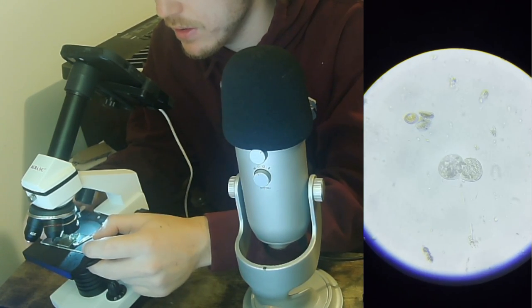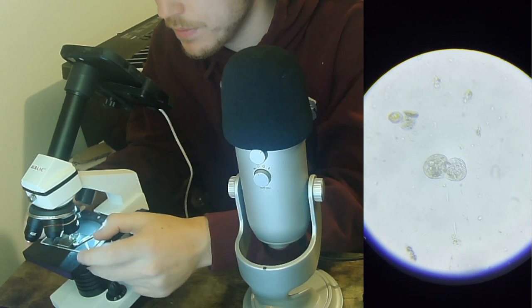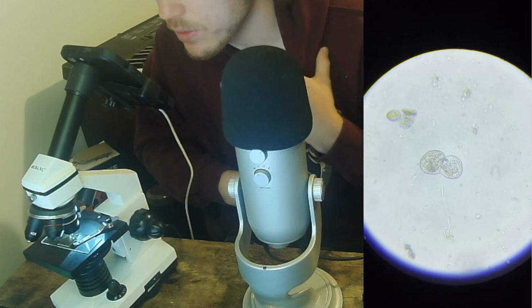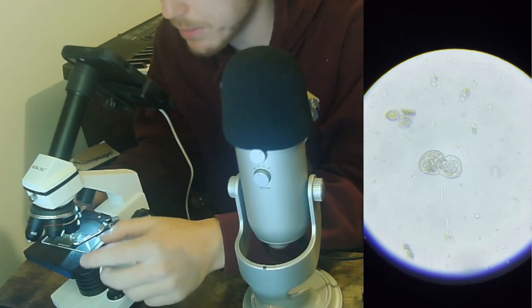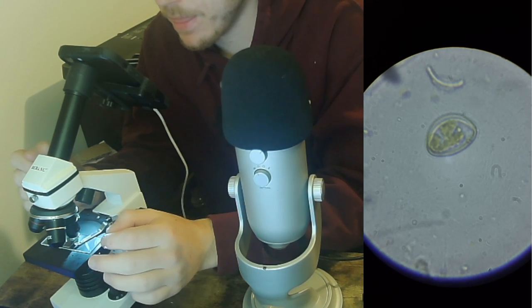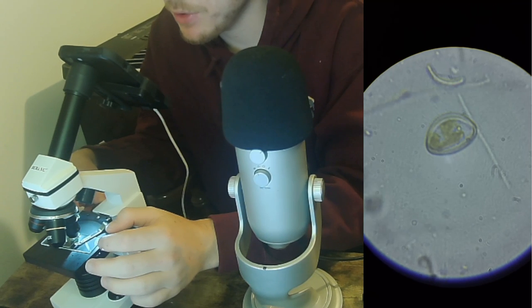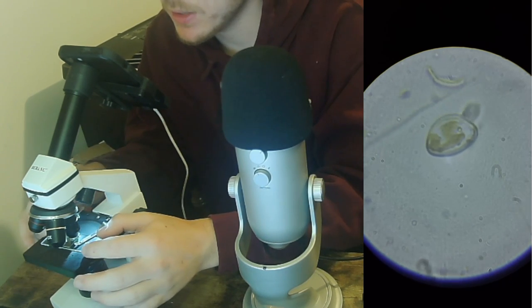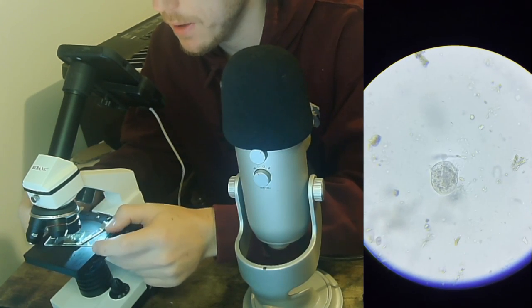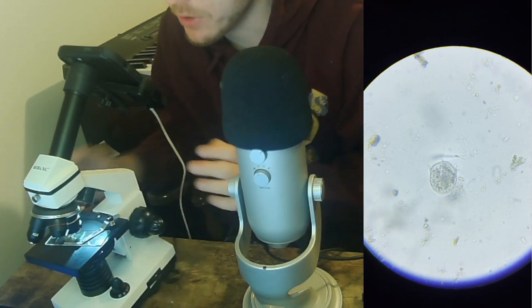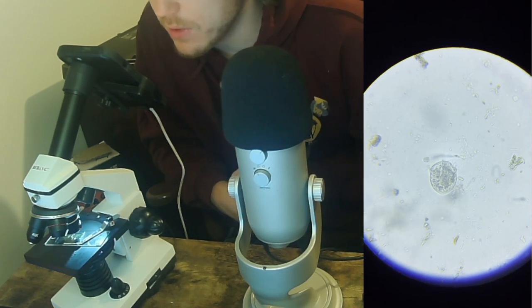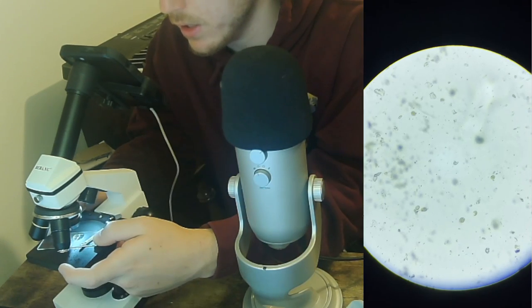Oh look at this! What's happening here? Are these two guys attached to each other in some way? What are they doing? And is this being pulled from them? These are what those guys look like much closer up, these little guys that you see everywhere which are just the circular type things that have the little green inside of them. Oh look at this guy! This is a clear ciliate. You can see on his front he has some of those hairs which I assume would allow him to move.